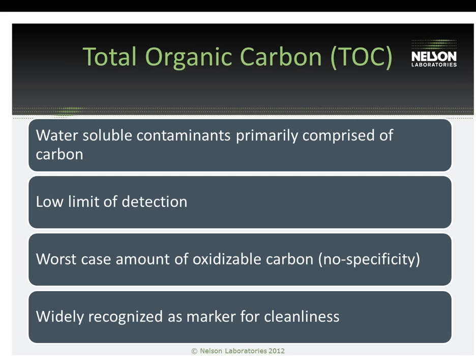So we submerge the device in water, again do a sonication or another rigorous shaking to remove those surface residues. We remove the device and take aliquots or samples of that extract and run it on the TOC instrument, and we're able to get a TOC, total organic carbon, readout of the oxidizable carbon that was present in that extract. So some benefits with TOC is that there's a very, very low limit of detection for this test method. We can go down in the part per billion range, and so TOC is very sensitive.